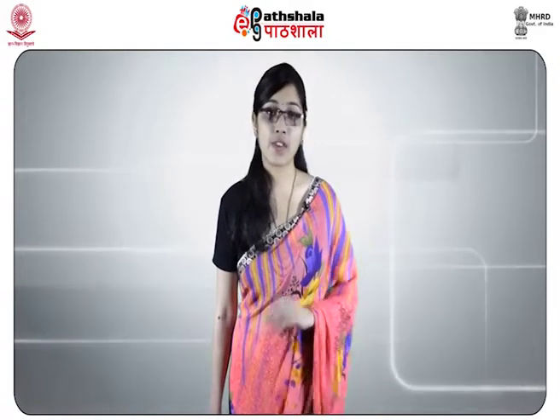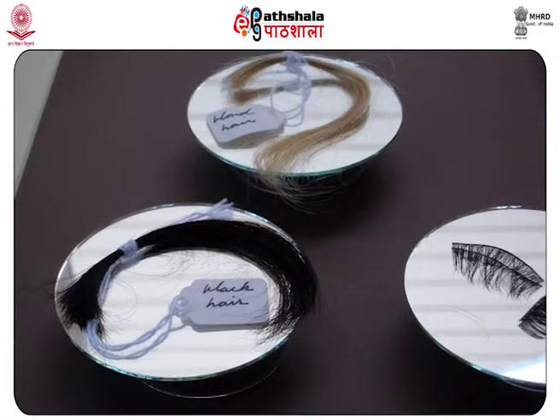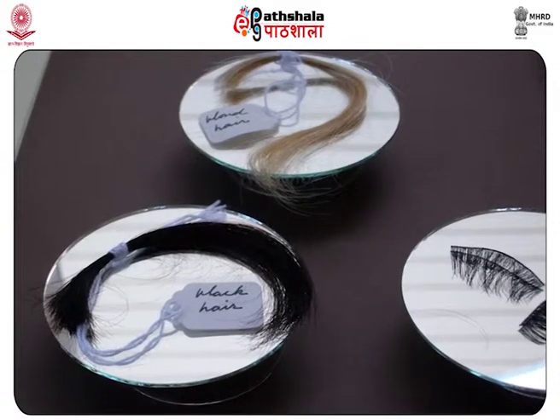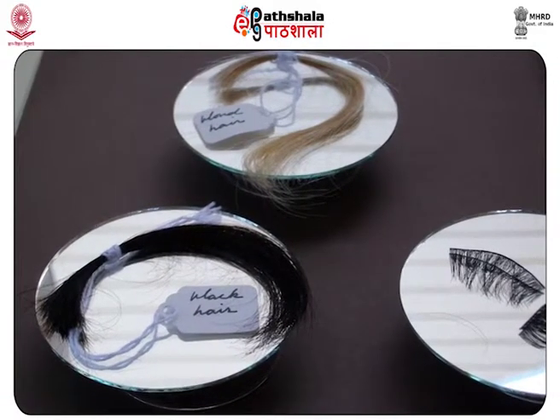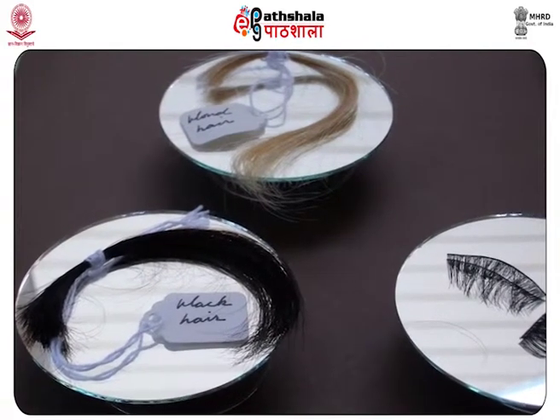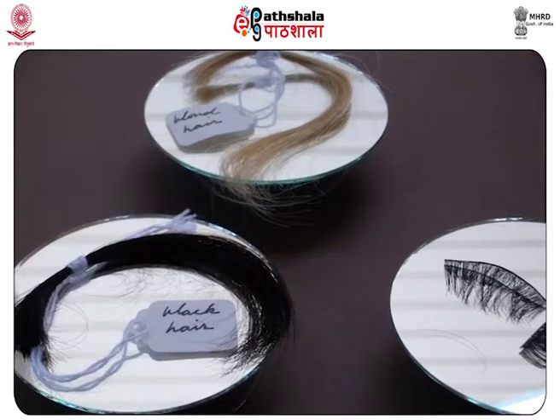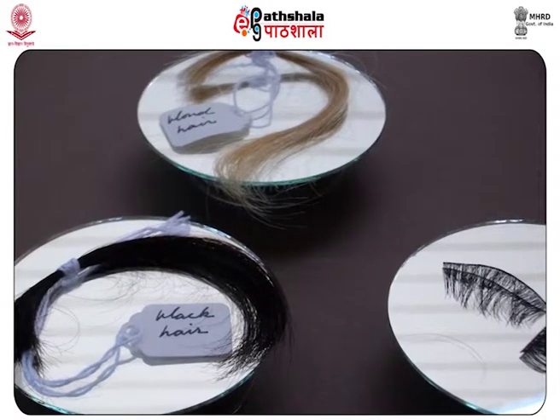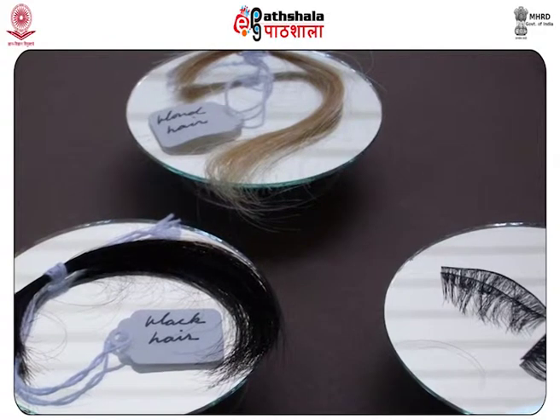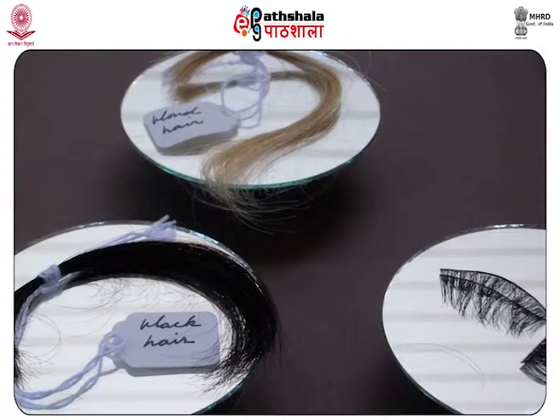Now about the forensic importance of hair. Mutual transfer of hair due to contact is a classic example of Locard's principle of mutual exchange of traces. Hair, if properly searched for, is found in a large number of cases. It is one of the earliest types of physical evidence which was considered, collected, evaluated and utilized in forensic casework. Individualization of hair with regard to its source has been eluding the scientists up till recently.